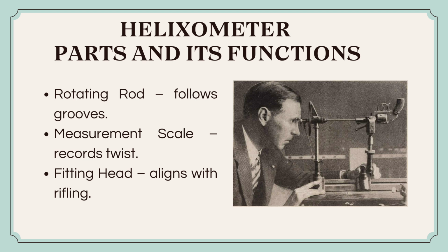A built-in dial or digital readout precisely measures how quickly the helical grooves within the barrel complete one full rotation, providing an exact, quantifiable measurement of the pitch of the rifling. Its significance lies in determining a key class characteristic of the weapon with high accuracy.